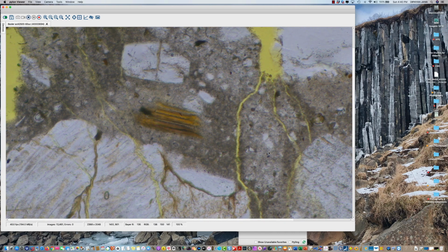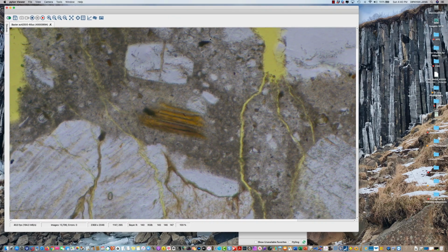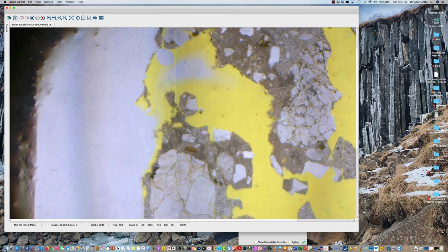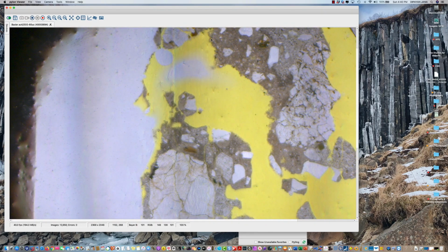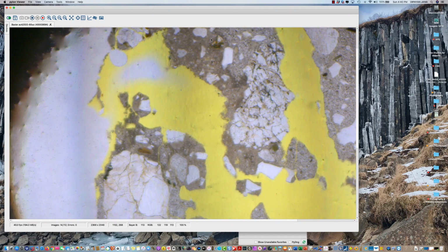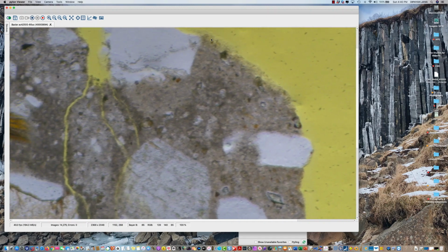So that's how the scale bars are put on each captured image. We remember the objective I'm using. Usually I stay at 10x objective. There is a 2x also in this particular microscope, but the 2x and then 10x, I usually use the 10x mode for fluorescent light observation.